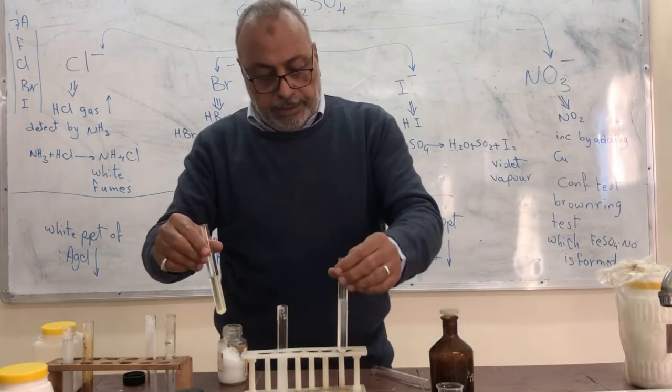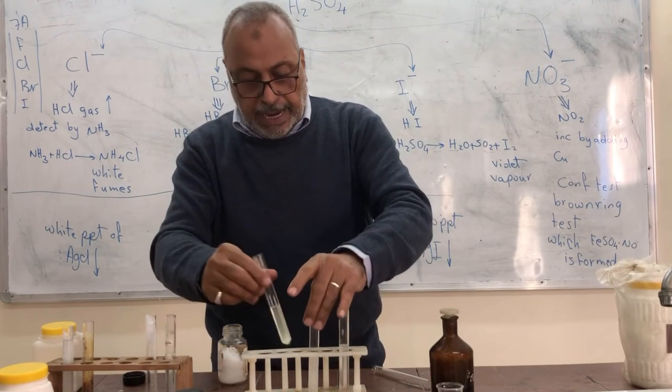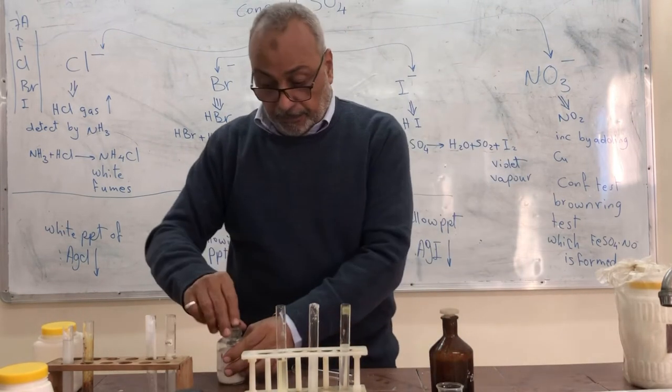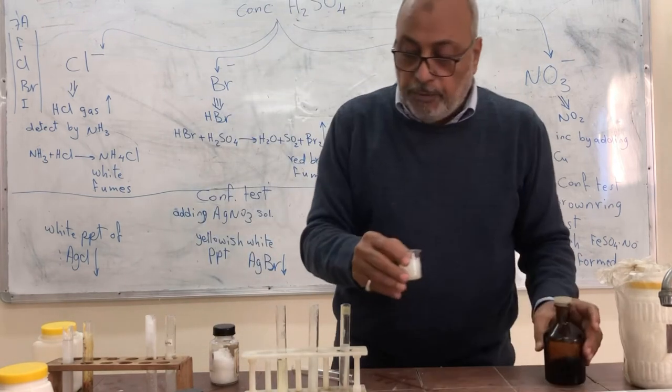The three salts are arranged: chloride, bromide, and iodide. We add silver nitrate to each of them as a confirmatory test.